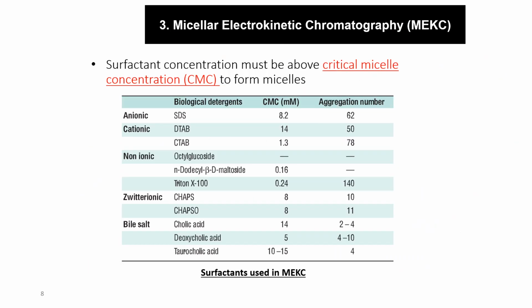Okay, in order for you to make micelle, you have to prepare your surfactant according to the concentration. For example, SDS from the previous slide, sodium dodecyl sulfate, can give you millions of micelles if you prepare the SDS at a concentration of 8.2 millimolar. Only a bit, which means you prepare only a little and you can get micelle already. If you prepare like 80 millimolar, then this number is going to be higher.